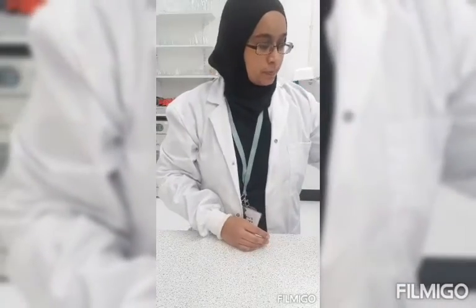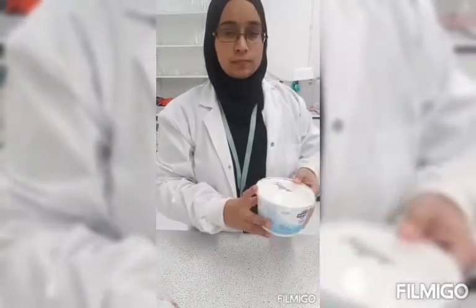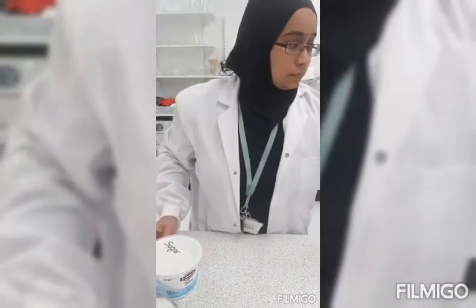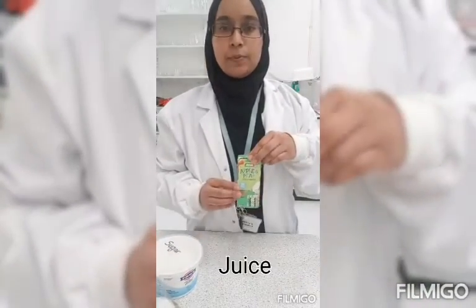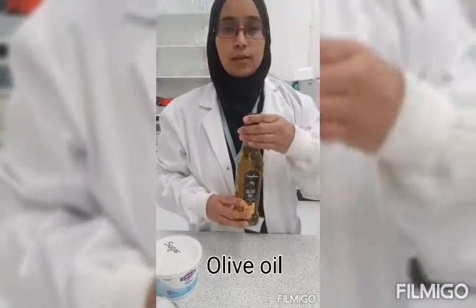Today's AQA required practical is on food tests. What you will need for this practical are a number of food items. I have some biscuits here, some sugar, some apple and pear juice and some olive oil.